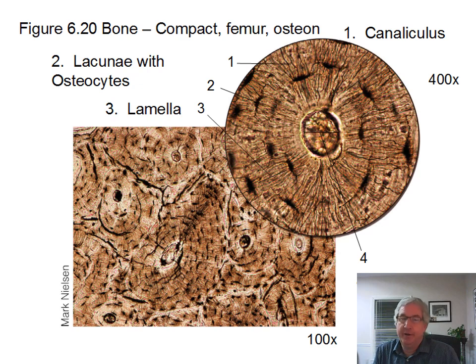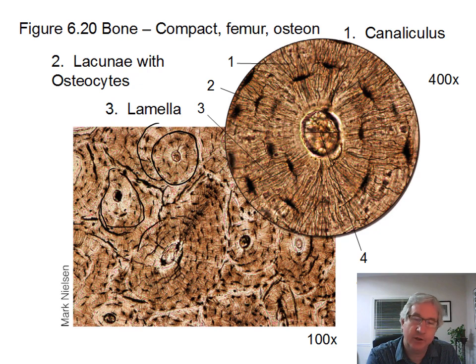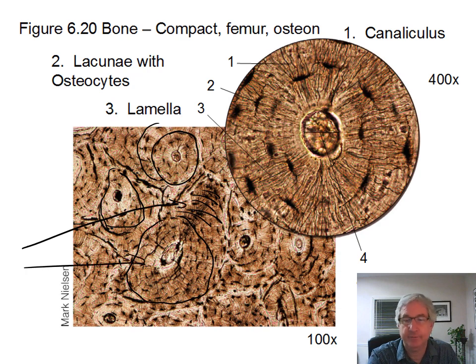When you look at it under the microscope, it's not quite as regular as it's drawn in the diagrams. So you can see here is an osteon here. Yeah, here's an osteon, and you notice that this is really an osteon here. I'm going to draw that, and here's an osteon here, and it's a little bit irregular. And here's an osteon that's a little bit more regular here. But you notice it has some other rows out here that kind of extend out. So this is really interstitial lamellae out here, and this is really the osteon here. Okay, so here's an enlarged one here.